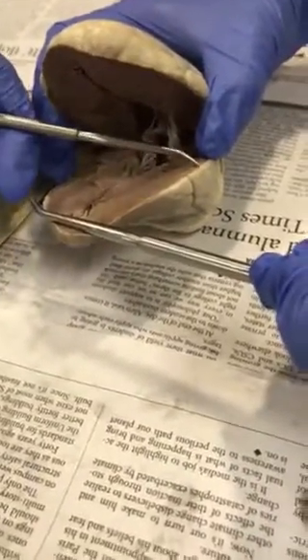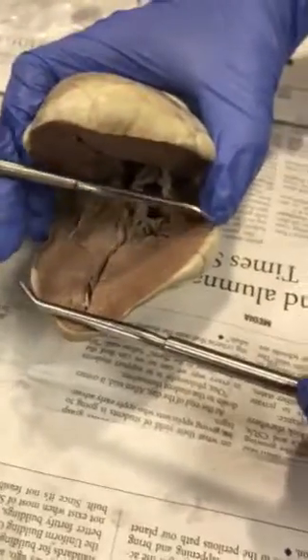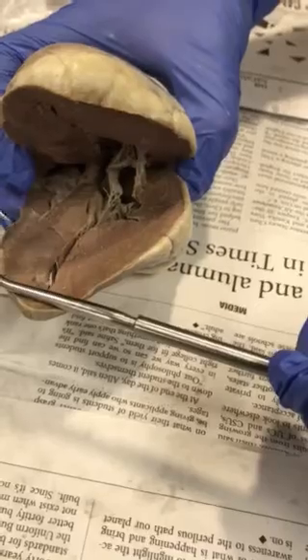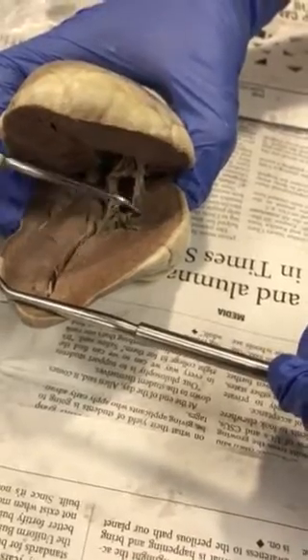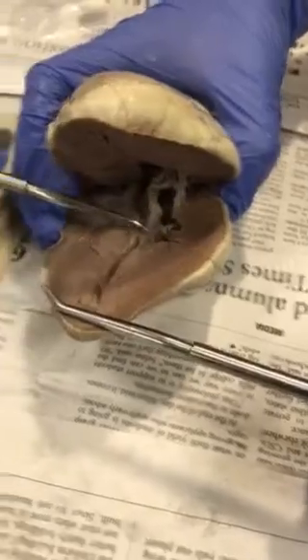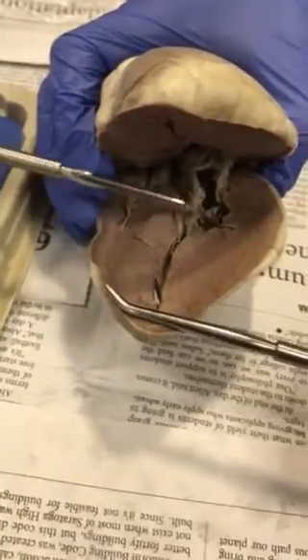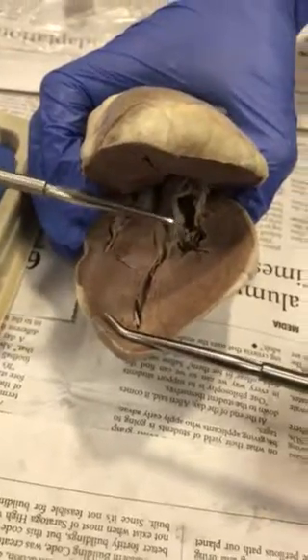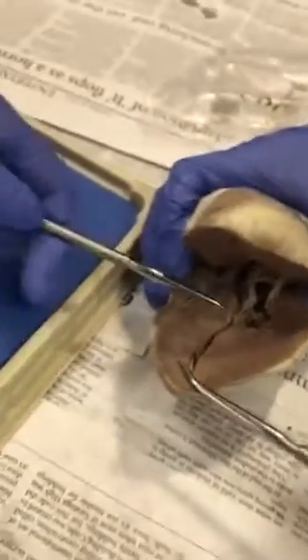This lining right here, this boundary between the dark and the light, is the epicardium. This part right here is called the myocardium. And this shinier part near the chordae tendineae and the papillary muscles is called the endocardium. We'll get more into that when we go into the blood flow.